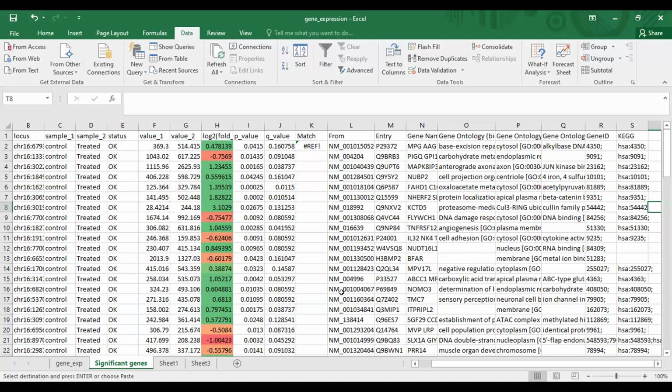Okay, and it is not tough, no, ma'am? Whoever is stuck with the annotation part, they can see her screen. Now try to sort this data, ma'am. Just copy this UniProt data.